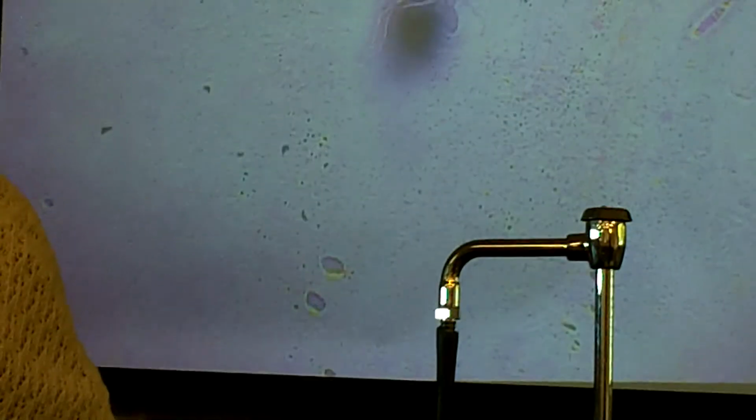So what we would do for the test is something like this, where you can see plenty of corpus luteum in view, but you can tell that you're in the ovary. That way you won't confuse this for an endocrine gland. You'll see ovary, but we put the pointer down here. And you'd be like, wow, the pointer's on something massive and glandular looking, but I know it's the ovary. It must be the corpus luteum. That's the approach we'll take. So again, corpus luteum, huge mottled thing.